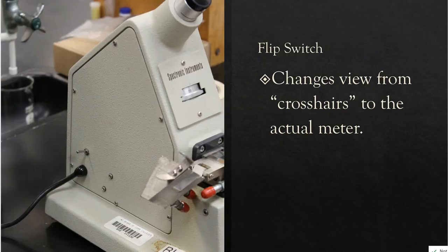Over to the left-hand side, we have a flip switch. And the flip switch, number one, flips the lamp on. And then once the lamp comes on, once I line up the dark and light half, I'll flip the switch down, and then I'll look through the eyepiece, and a meter will appear, a magic little meter, for me to write down my value.